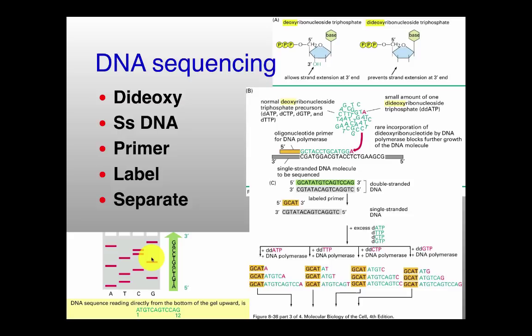And so this development of the polyacrylamide gel was really, really important. Again, small at the bottom, large at the top. To do these kinds of gels, what you have to do is now include a DNA polymerase. The way that this happens is through the so-called dideoxy or chain termination technique. All that you do here is a DNA polymerization reaction with normal nucleotides with your 3' OH on them and so-called dideoxy nucleotides that have no OH at the 3' position.